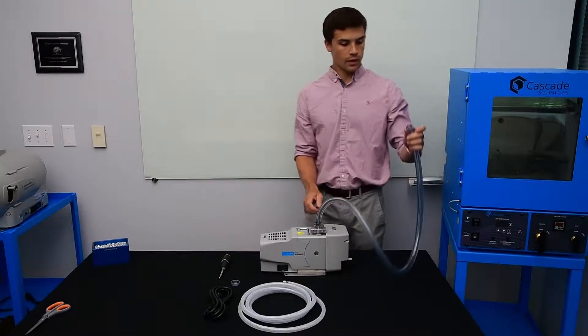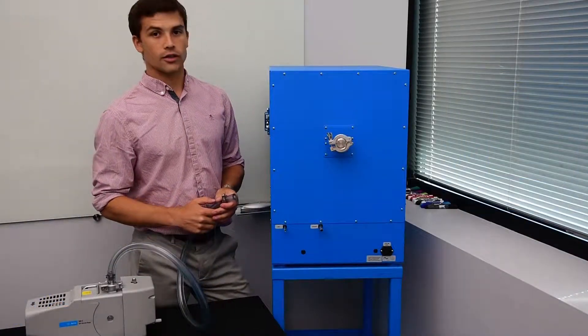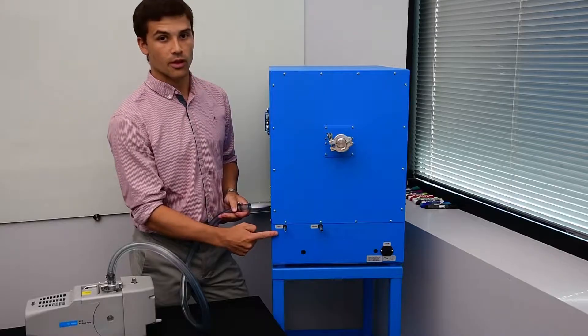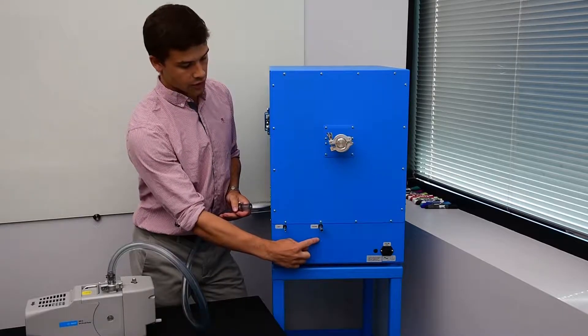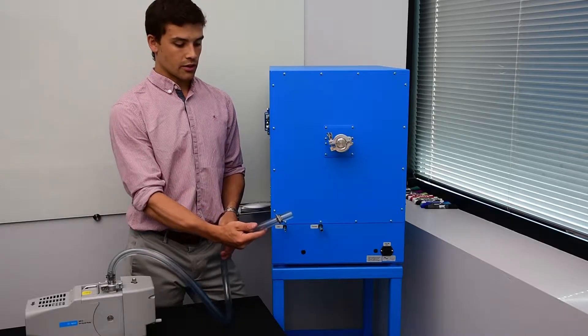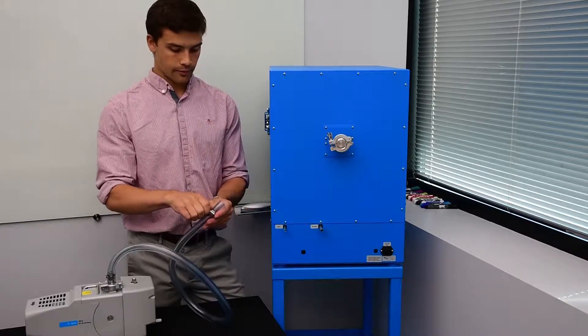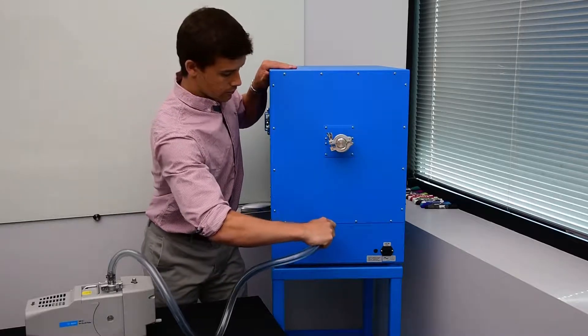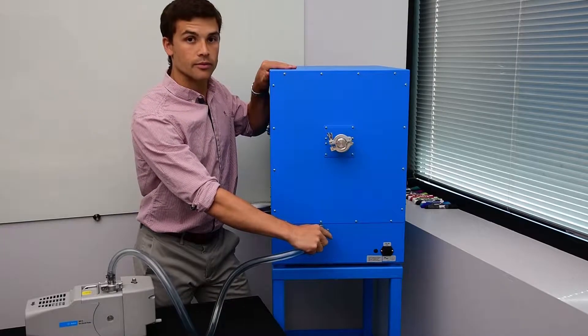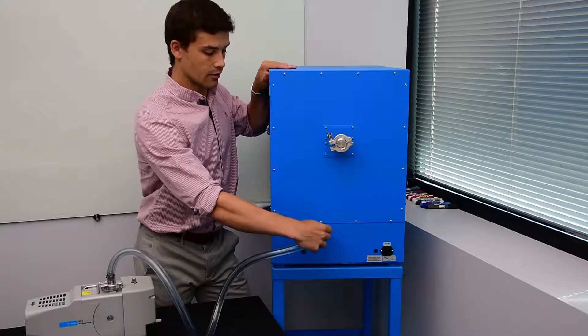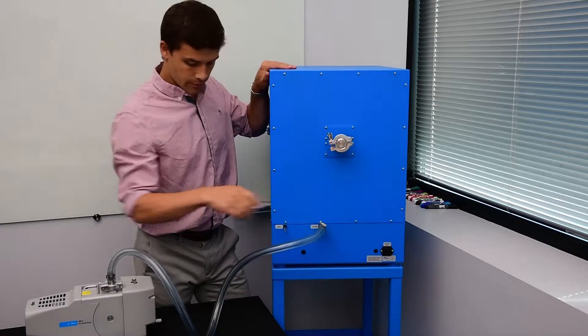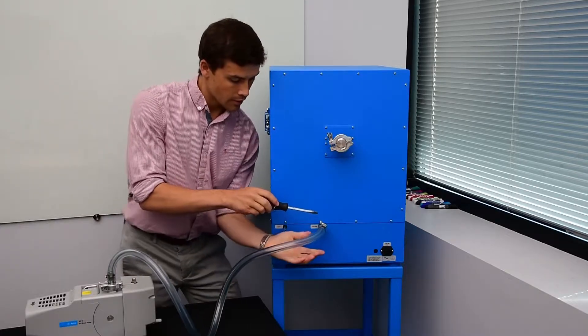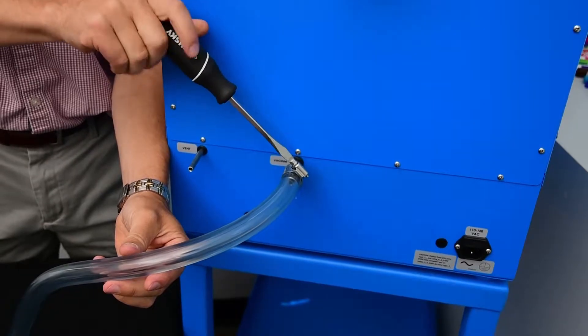Make sure that's tight. There are two vacuum barbs on the back of your vacuum oven. The smaller one is a vent and the larger one is a 3/8 inch and that will attach to the vacuum hose. Now we'll slide the hose over the barb so there's enough for a good seal with the clamp. Take the screwdriver and tighten the clamp up.